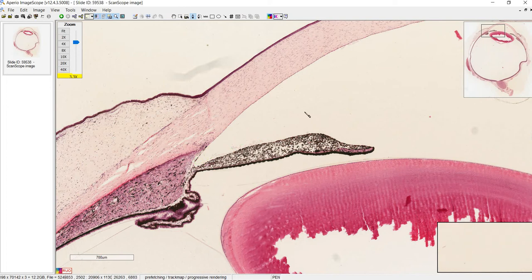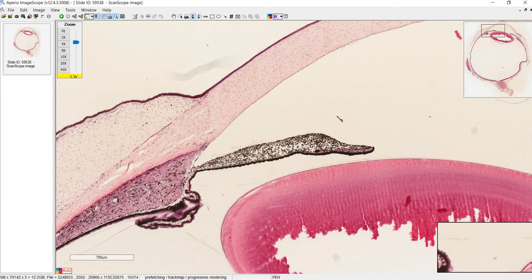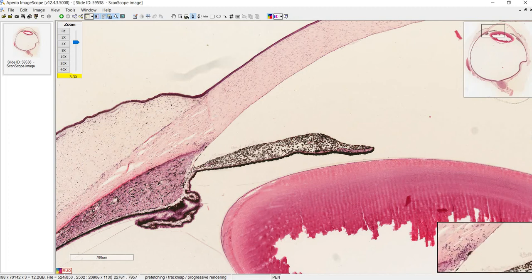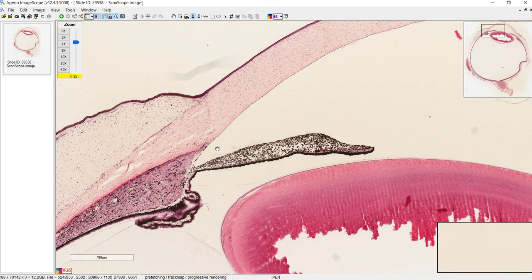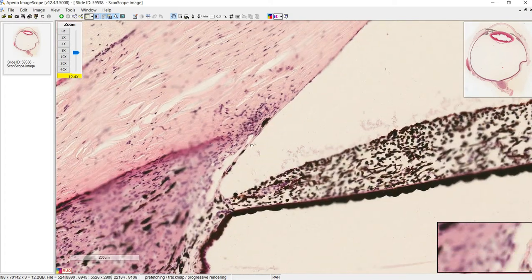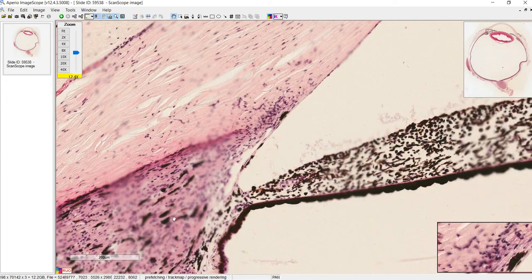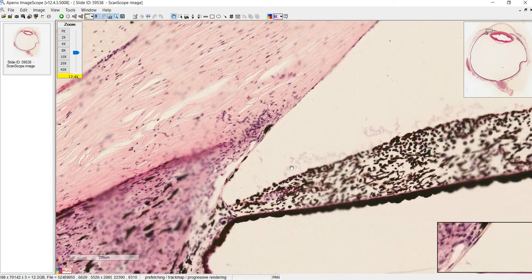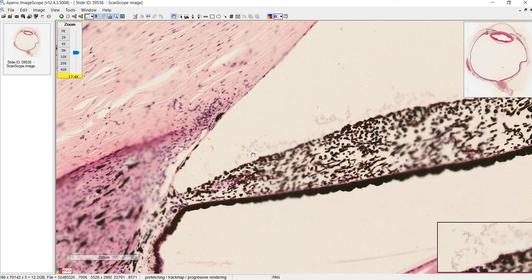Open-angle glaucoma happens with age — it's a slow degenerative process where there's an imbalance between how much aqueous humor is produced and how much can be drained. Acute closed-angle glaucoma, on the other hand, involves an actual obstruction where the iris closes in and blocks the angle, causing a sudden increase in intraocular pressure. If we look closer, this is where the trabecular meshwork should be, though the canal of Schlemm is a little difficult to see clearly here — some of it may be artifact. It should be easier to see in the other slide.